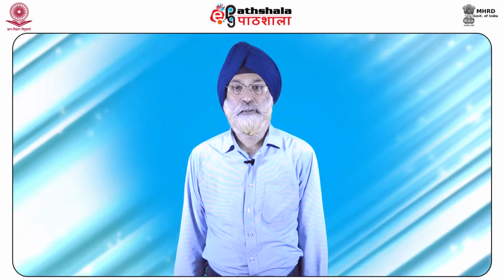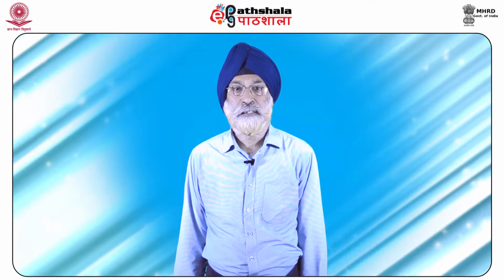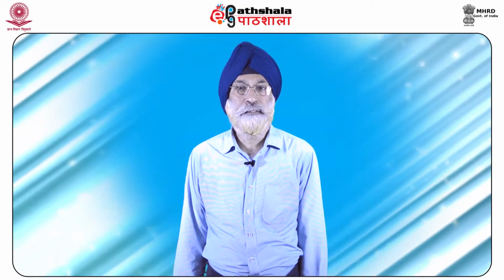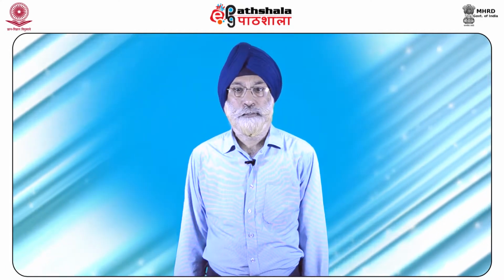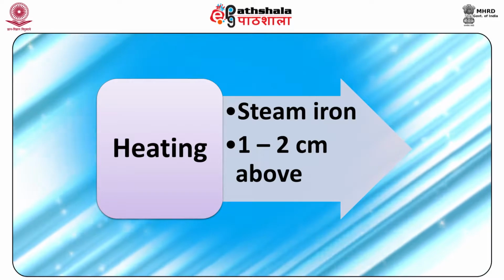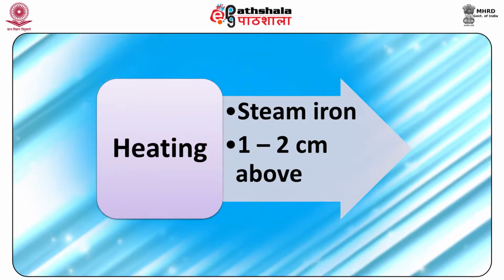If development time is not a constraint, ninhydrin sprayed documents should be allowed to develop at room temperature. This may take a few days, but the results are excellent. Normally, however, the surface is heated to 80 degrees Celsius so as to accelerate the development process. The mode of heating is also important. Heating may be carried out by a steam iron. Better results are obtained if the iron is moved 1 to 2 centimeters above the surface. Most forensic science laboratories have adopted this procedure.